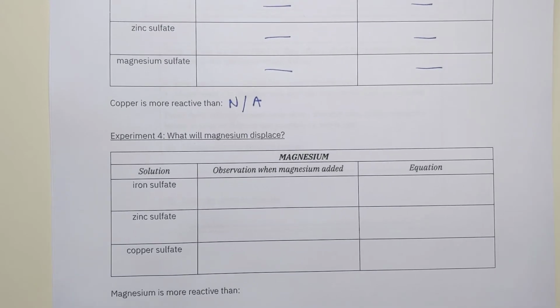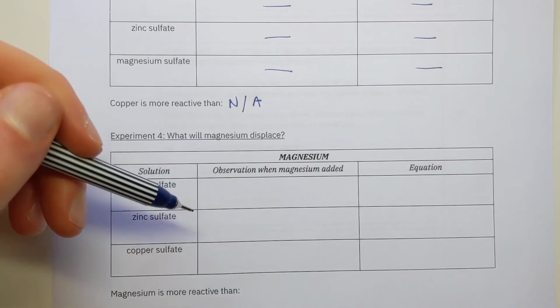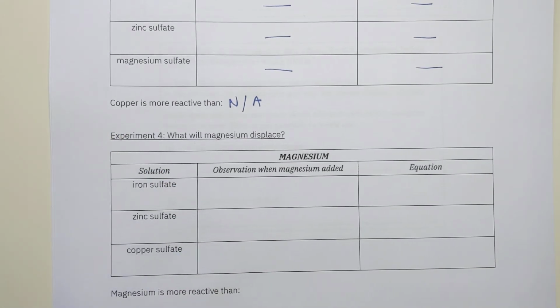Final one, magnesium. Again, just to confirm what I think I know already. If I add magnesium to iron sulfate, zinc sulfate and copper sulfate, I get equations and observations in every single case.